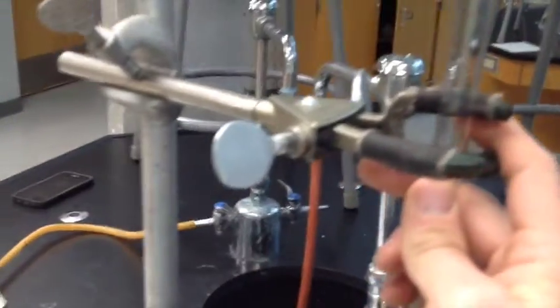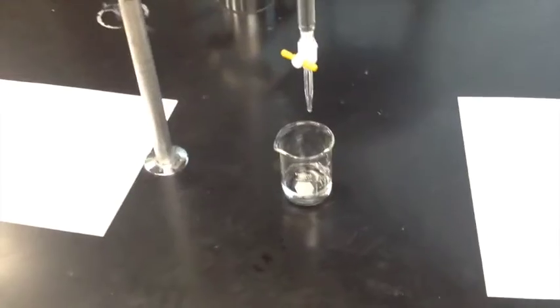And in the same breath, you want to make sure it's tight enough that it doesn't just fall straight onto the table and break the tip. Of course, we can replace the tip. The expensive part is the graduated part, but still, be careful when you're setting this up.